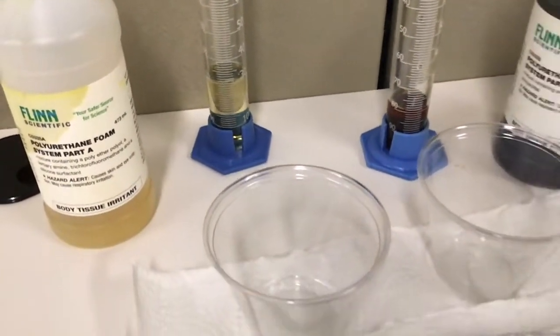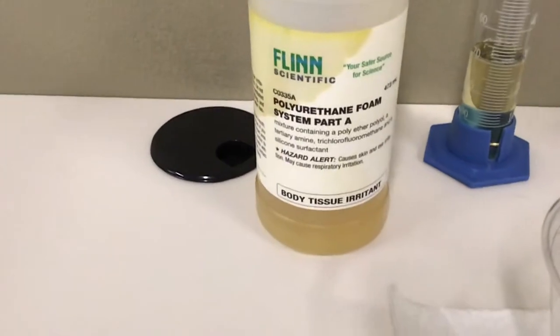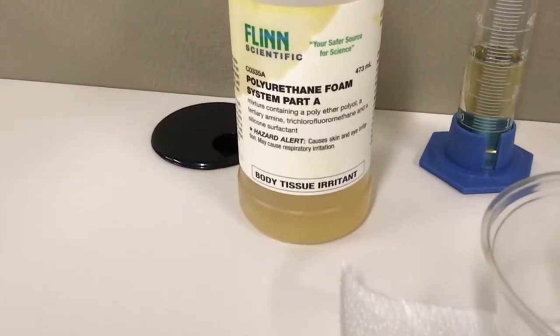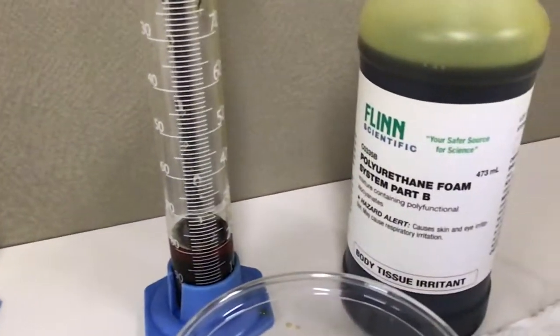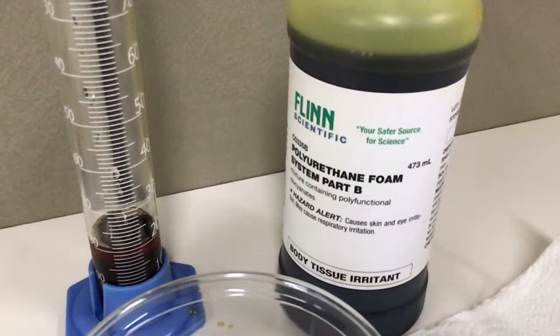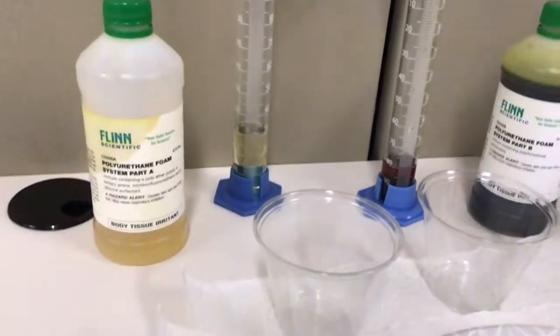So let's take a look at writing down, or I should say typing, 2 safety rules. I will definitely zoom in on solution A, if that will help you. Record a safety issue. And here is solution B. Very similar hazard alerts. Of course, we have our graduated cylinders.